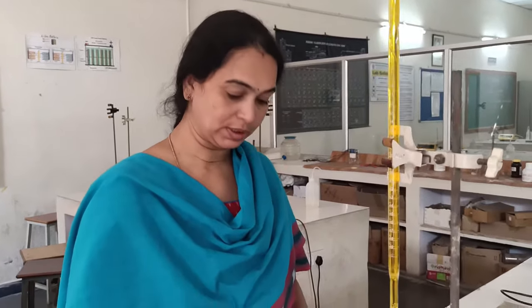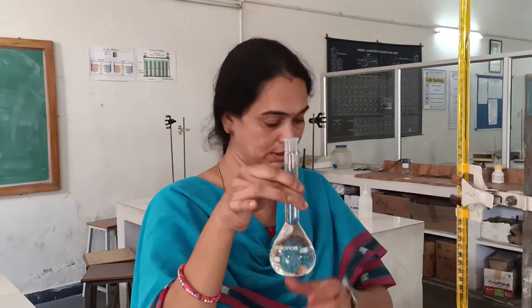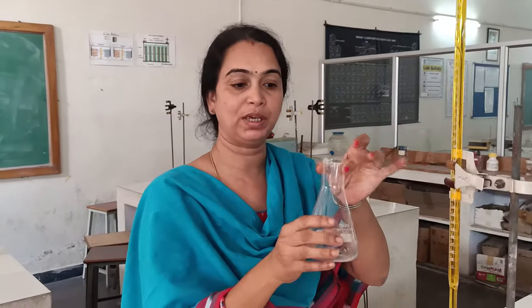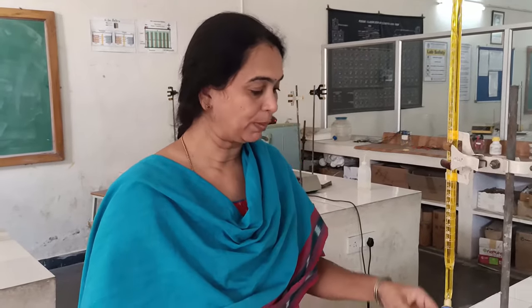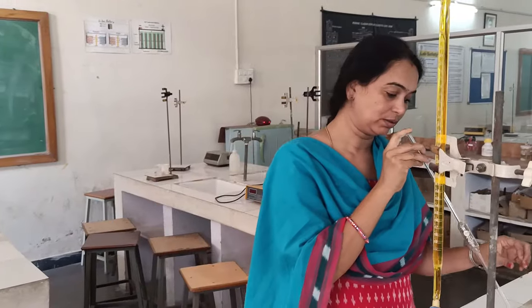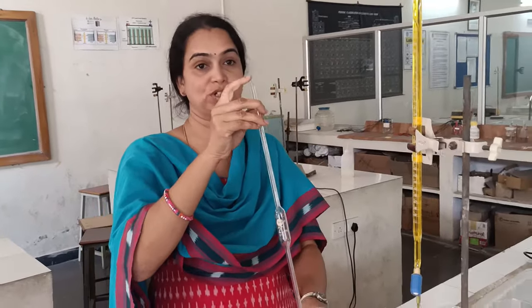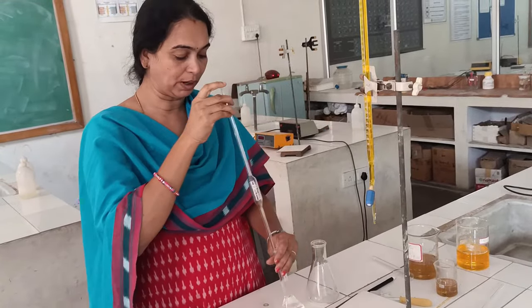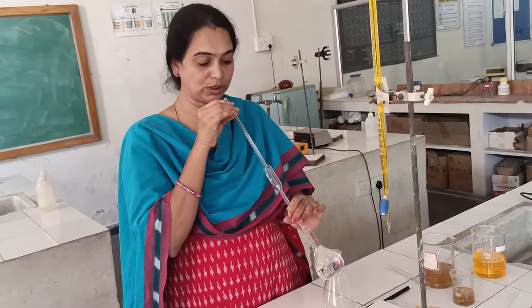Now for the standardization, the standard FAS solution is taken in the conical flask. Every apparatus should be washed clean with tap water. For the pipette, wash it with tap water, then rinse it with the ferrous ammonium salt solution, because you are taking this solution into the conical flask. Now take 20 ml of ferrous ammonium salt solution into the conical flask using the pipette. Hold the pipette in a slanting manner and don't blow air into it.